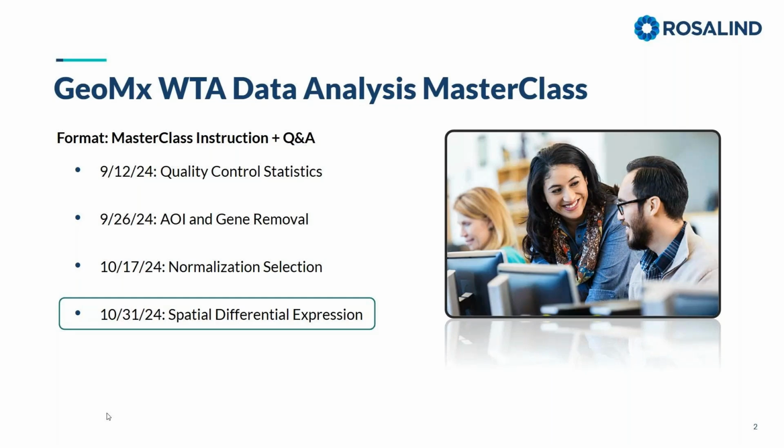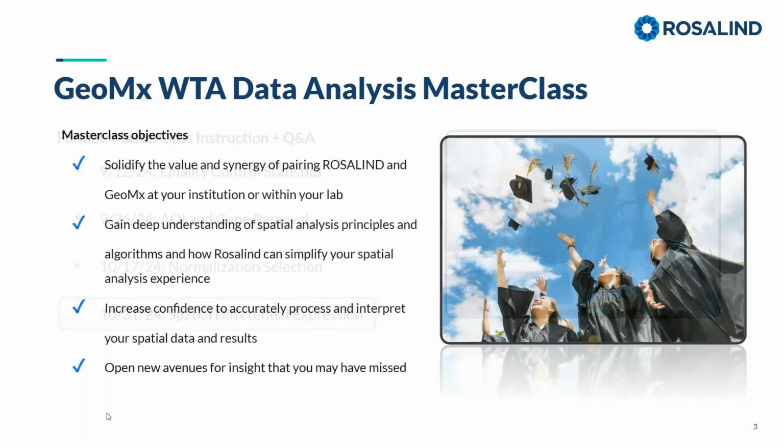And so finally, we're in this last step where now that you're really confident in your data and how it's been normalized, we want to finish this off with our spatial differential expression and learn how this is really important and still a key step in how you want to look at your spatial data.